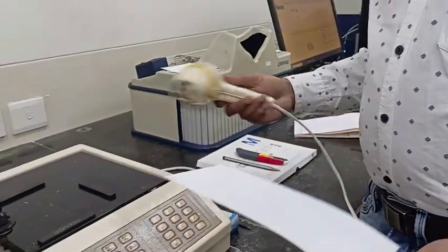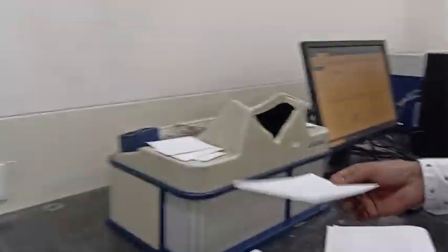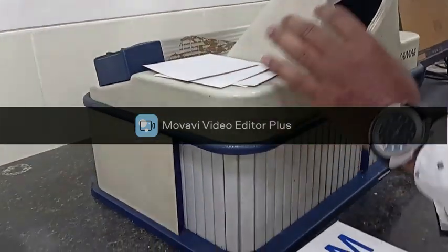After drying, we will see the bands inside this UV chamber. We will see them at 366 nanometer wavelength. You can see the bands are formed. The first 6 are from benzophenone, the next 6 are from benzhydrol, and the last 3 are from the samples.